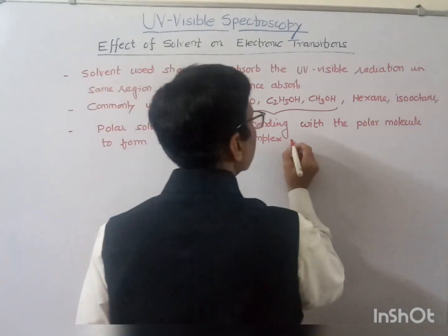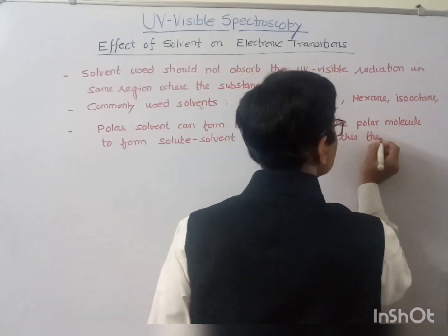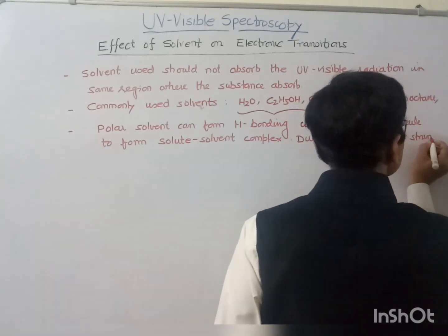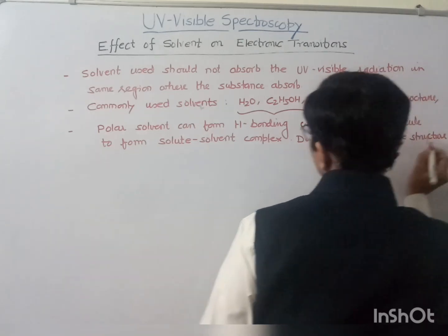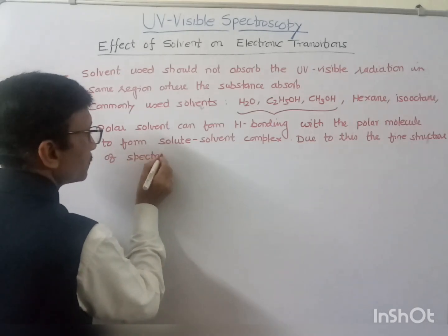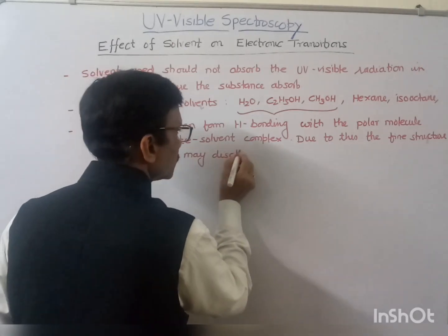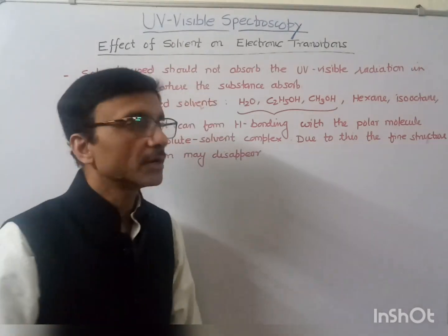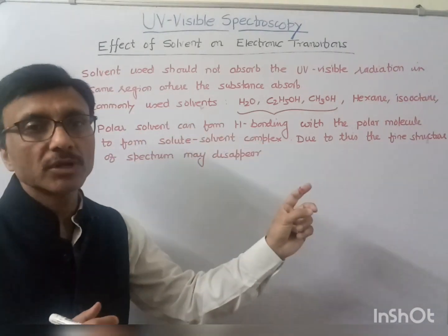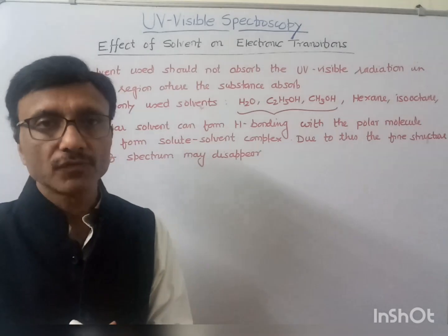And due to this, the fine structure of the spectrum may disappear. So what does it mean? If some interaction is there between the polar solvent and the polar molecule, then we will not get the fine structure of the spectrum.